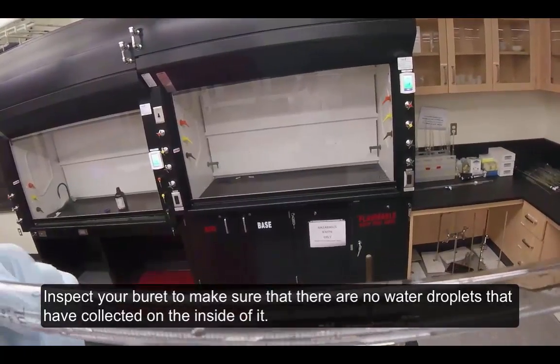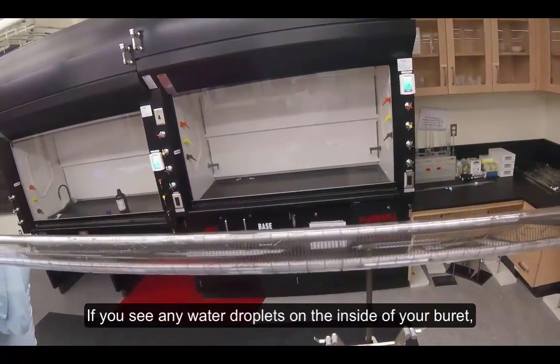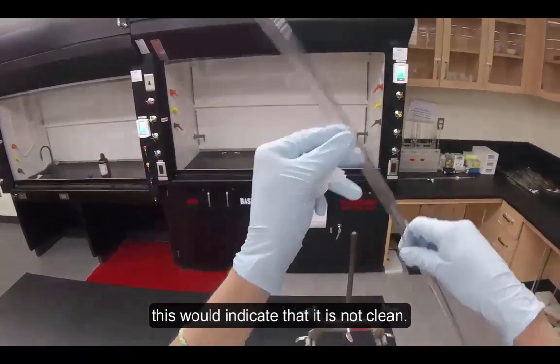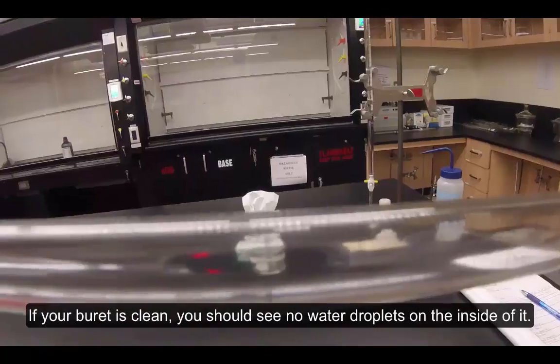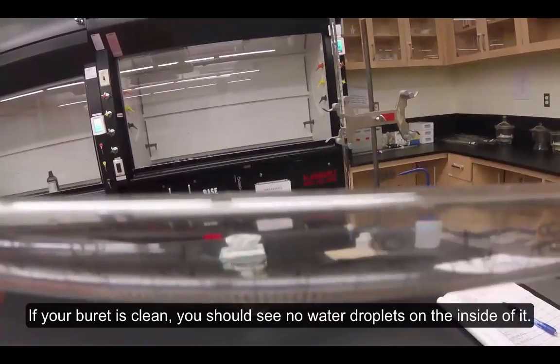Inspect your burette to make sure that there are no water droplets that have collected on the inside of it. If you see any water droplets on the inside of your burette, this would indicate that it is not clean. If your burette is not clean, contact your instructor. If your burette is clean, you should see no water droplets on the inside of it.